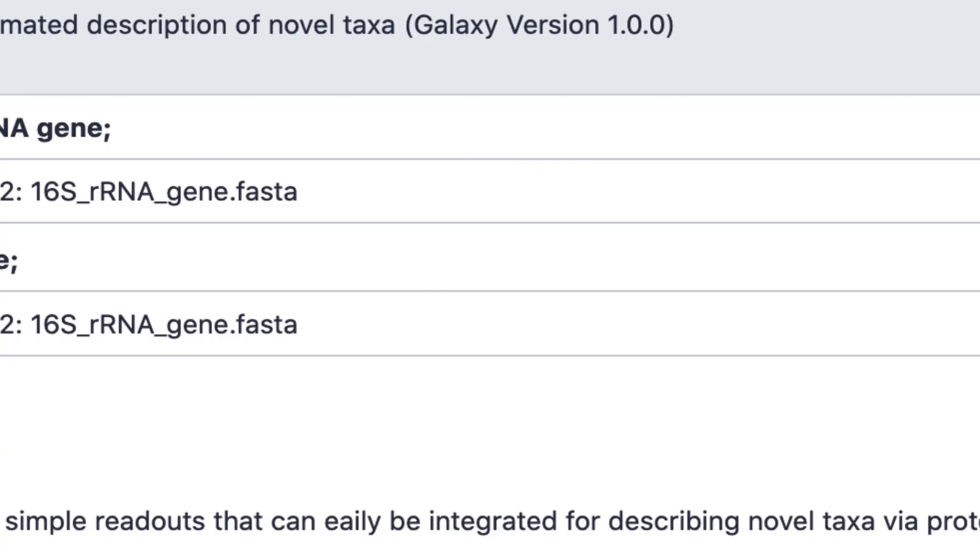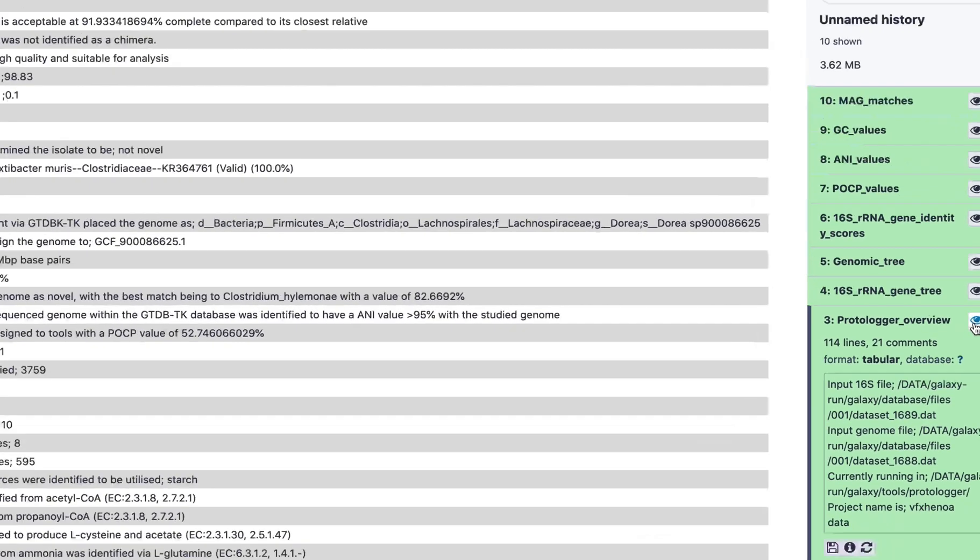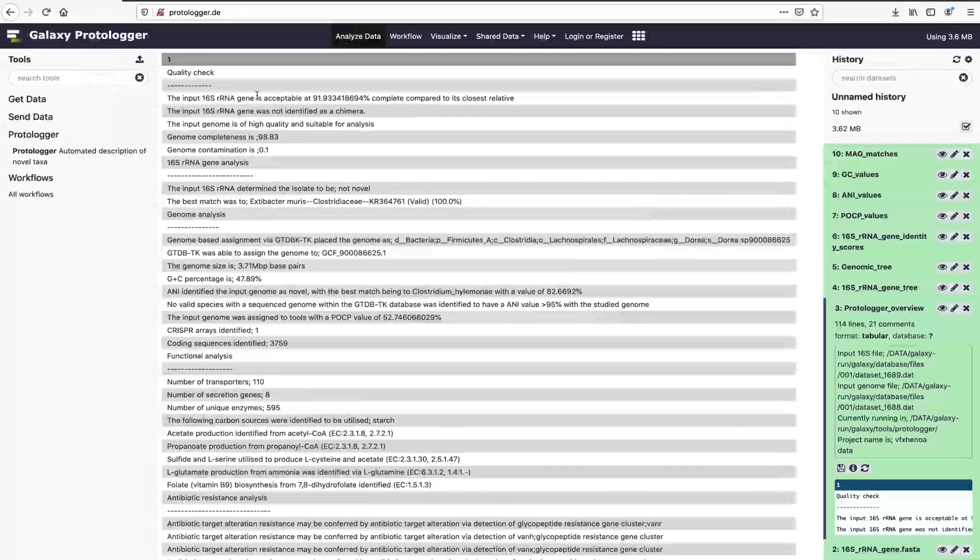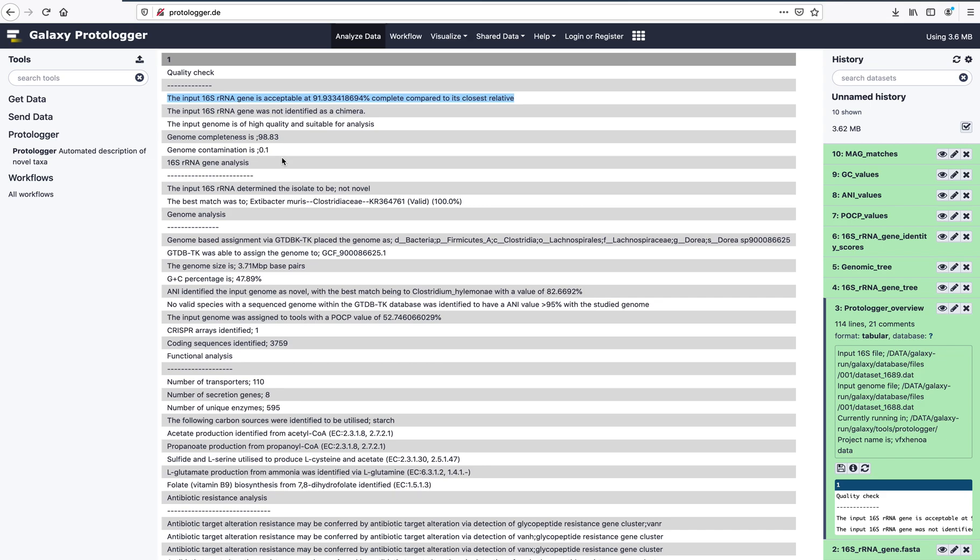The Protologa overview file acts as a combined readout for the user, providing all key pieces of information. By clicking the i sign above any of the files, you can view the data inside. First we see the quality analysis of the input data, which confirms that the input 16S rRNA gene is complete, as is the genome.